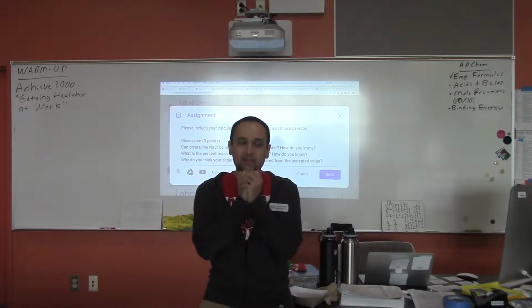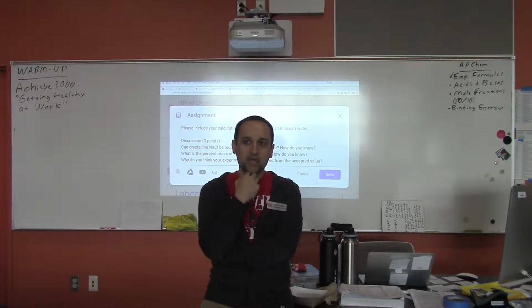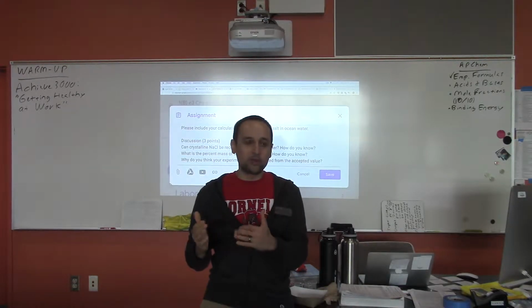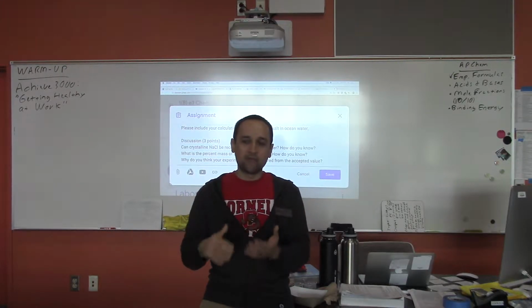And you're like, man, I would love to have... so the reason we used the beakers was that the beakers allowed us to do the experiment fast, right? We got through 32 ocean water experiments in 2 days, okay? And our turnover had to be quick. We don't have that many little beakers, so we had to turn the beakers over every couple hours, right?